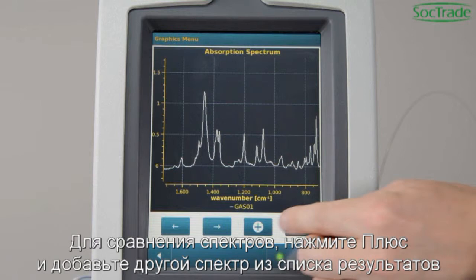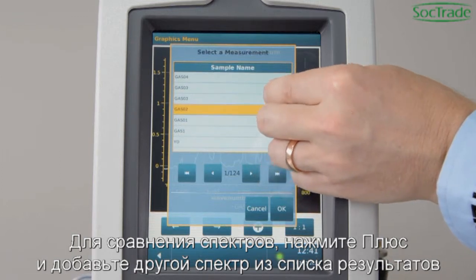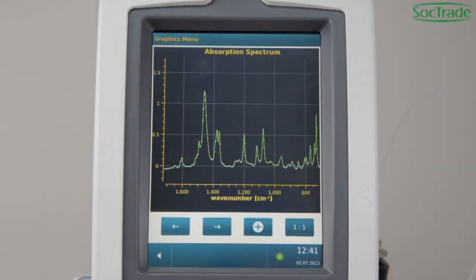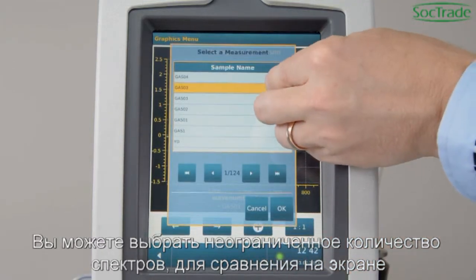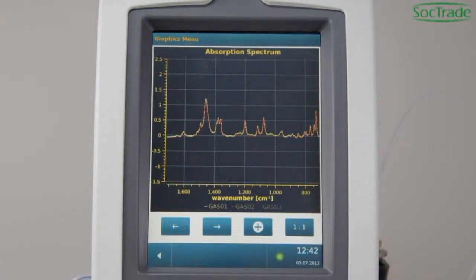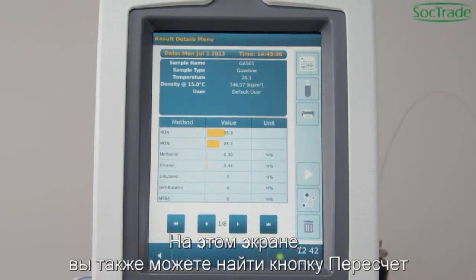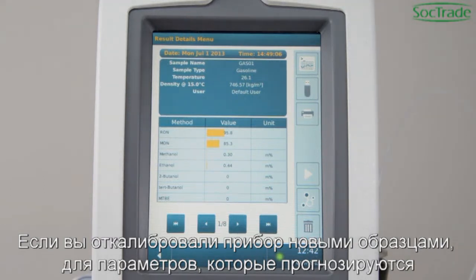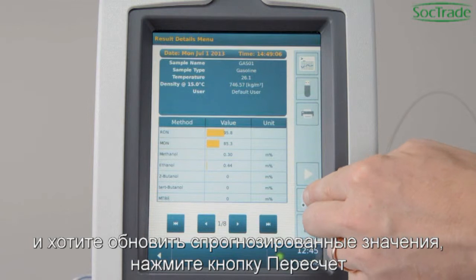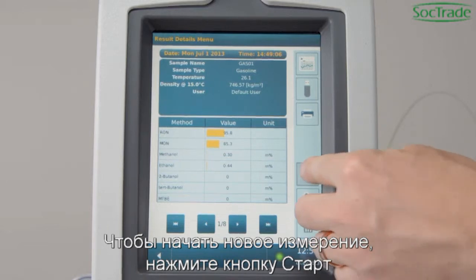For spectrum comparison, press Plus and add another spectrum from the results list. You may select an unlimited number of spectra for comparison on the screen. Press Back to get back to the result. In this screen, you also find the Recalculate button for later use. If you have calibrated new samples for parameter prediction and want to refresh predicted values, press Recalculate. To start a new measurement, press the Start button.